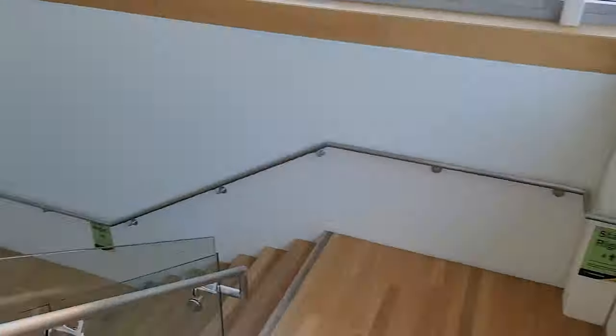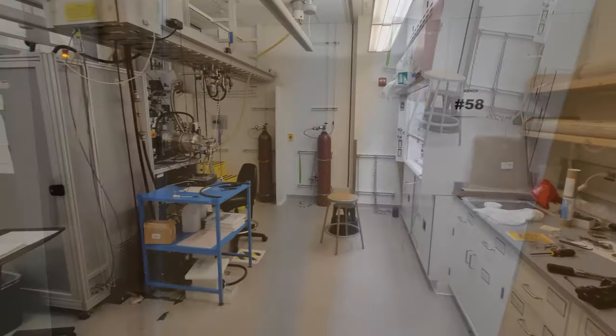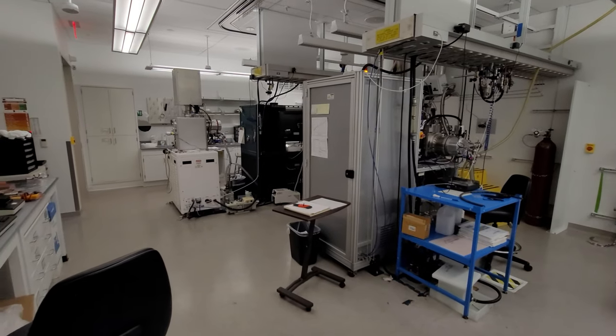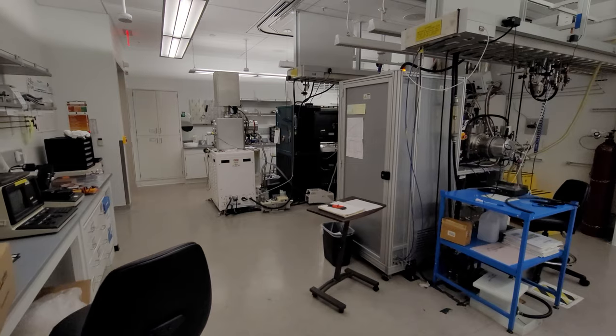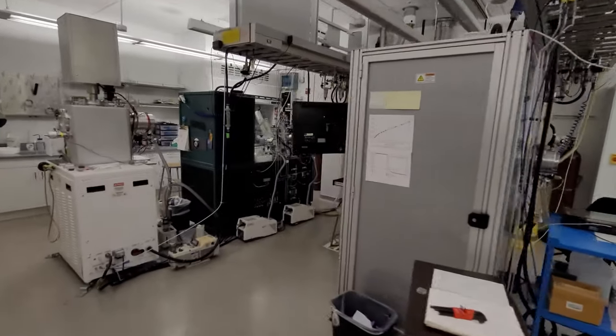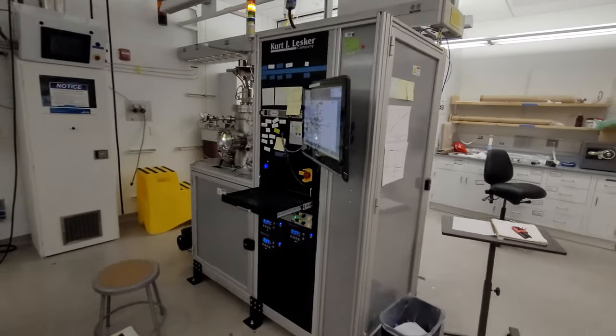Let's now head down into the labs and see how these materials are scaled up, evaluated, and tested. The deposition lab houses equipment for E-beam evaporation and sputtering, which allows for single or multi-element metals, oxides, and nitrides to be deposited on a variety of substrates, with precise control over composition and thickness, ranging typically from 1 to 1,000 nanometers.